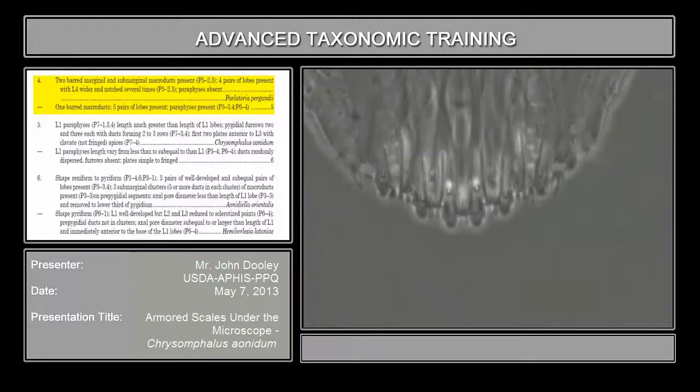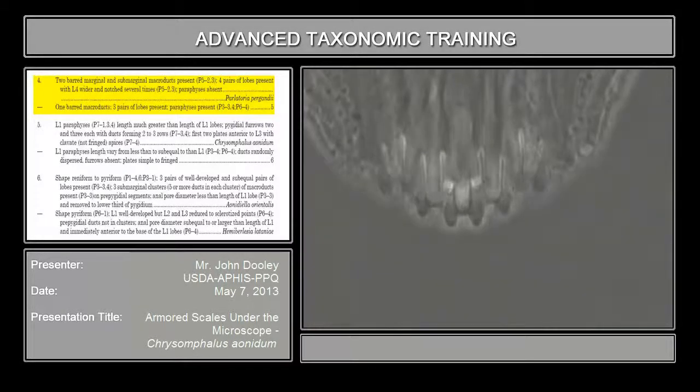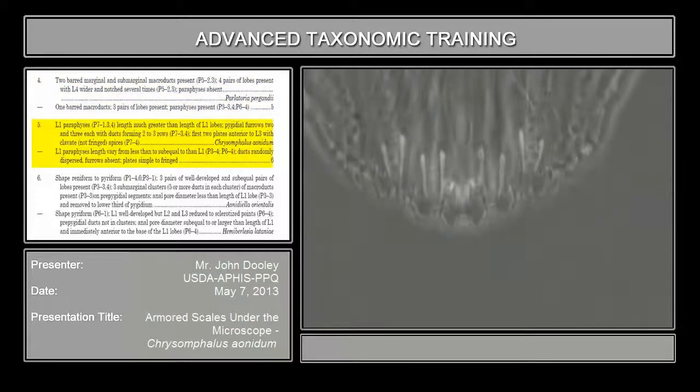The other thing — the more important one on this particular species, and you'll see these — this is one of the more common ones. I mentioned earlier: paraphyses. You can see them over here. These come at the base of the lobe, up — base of the lobe, up. You notice the length of these are much longer than the length of the medium lobe, and that's also very important, because the next group you're going to look at, they're going to be much shorter, very minute, and it's going to be a different genus.